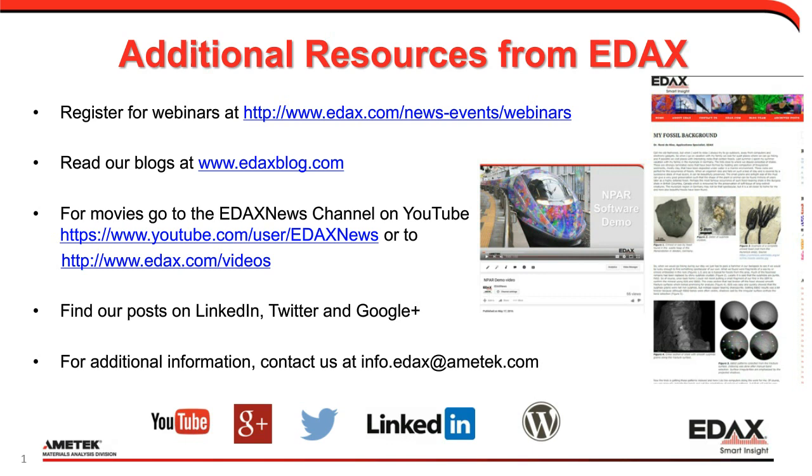But if you're interested in doing your own, there is that available, and you can just look on the web on the GitHub for EMSoft. And if that's the route you want to take, then I would look into that, and I'm sure those maintaining that can help you with some of the questions you have directly.